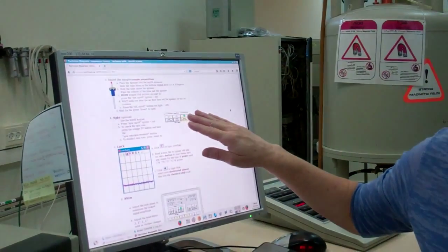Number three, properly placing our NMR sample into the magnetic field. And number four, optional spinning of the NMR tube inside the probe.